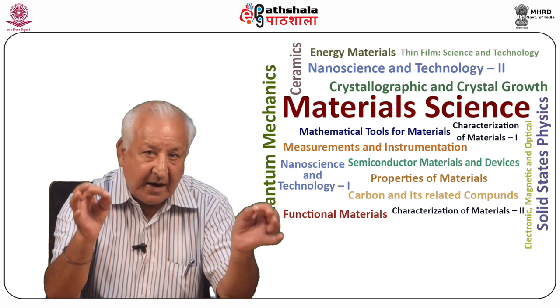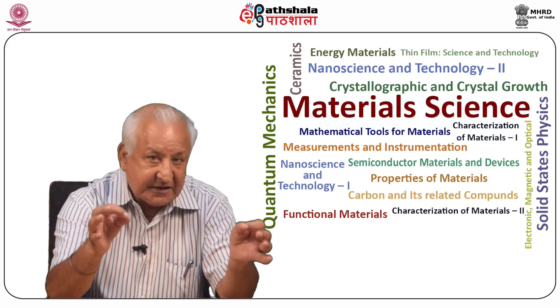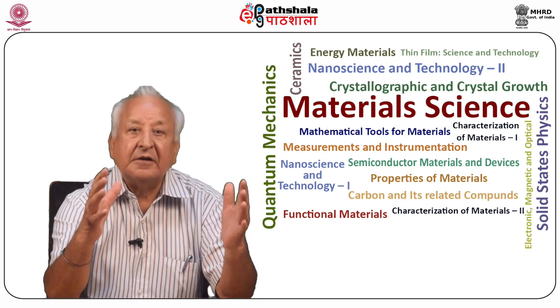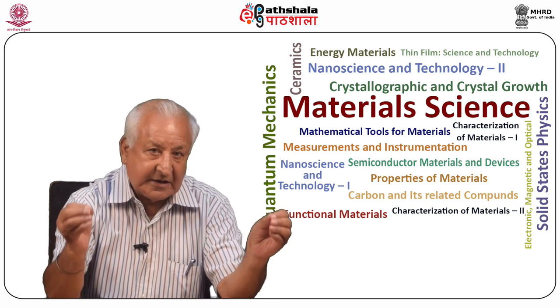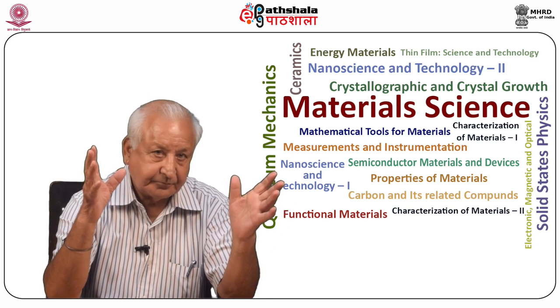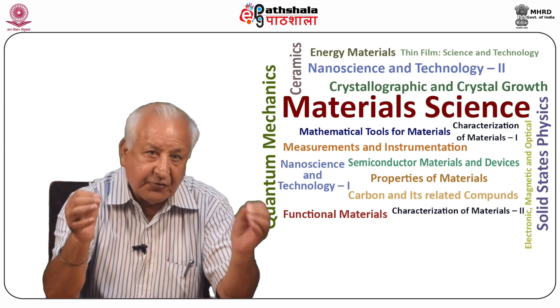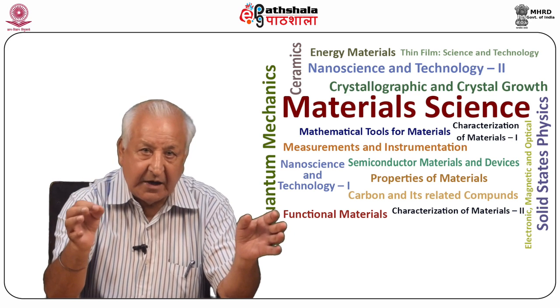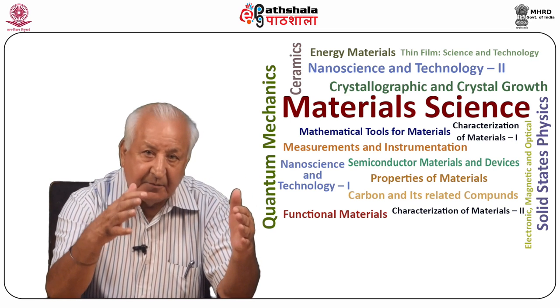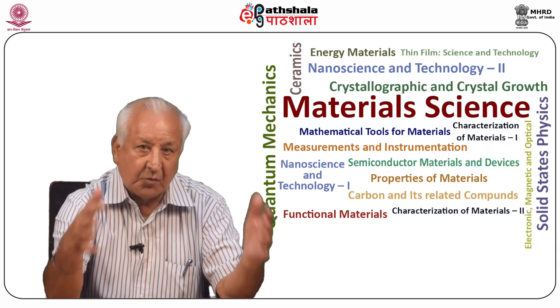That is what is actually meant by one-to-one correlation between what exists in the crystal and what gets imaged and registered in the topograph. To enable this to happen, certain experimental conditions are required to be met. Let us describe those conditions which will have to be realized in order to obtain one-to-one correspondence between what exists in the imperfect region and what is detected in terms of contrast of the topograph.